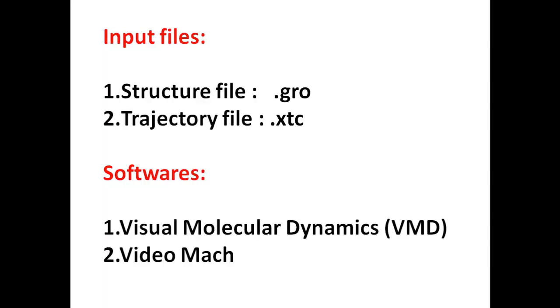Suppose you have performed MD simulation of a protein-ligand complex over around 100 nanoseconds and you want to create a simulation video. For that you are going to need two kinds of input files: one structure file containing the structure of protein, ligand, water molecules, and everything. If you have performed MD simulation using GROMACS, the structure file will have extension .gro. Along with this structure file you are going to need a trajectory file, which contains information about the movement of the protein complex.